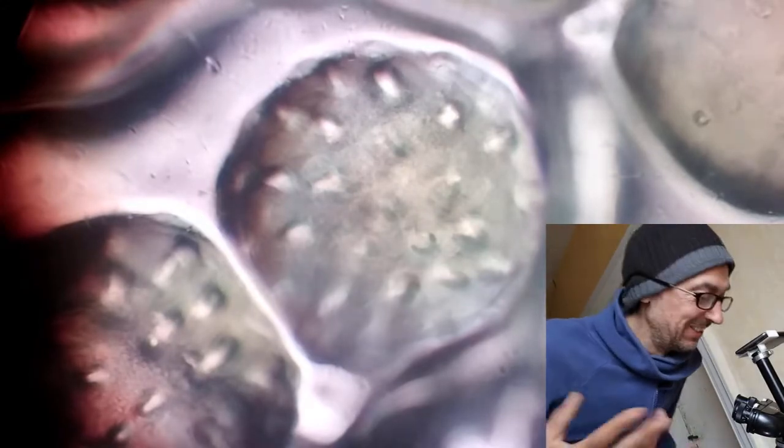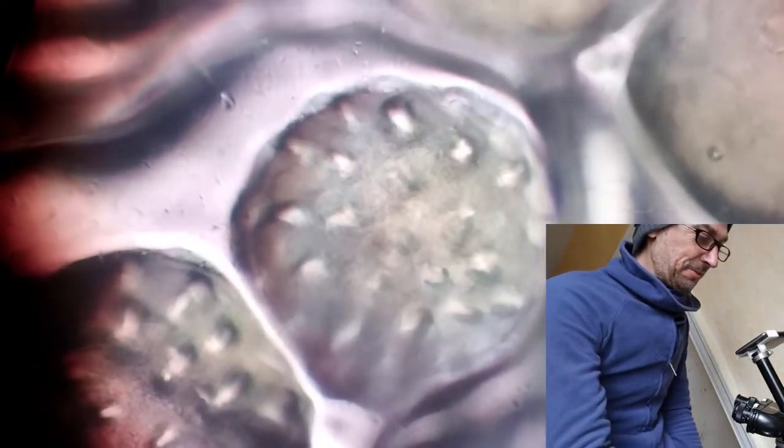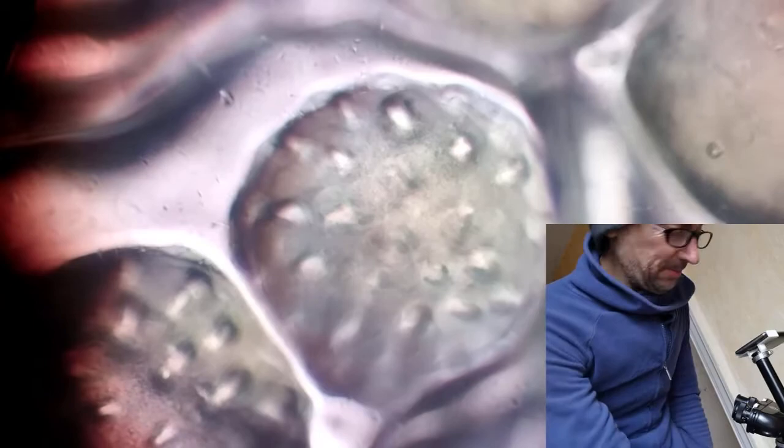I'm just plug and play - it has to work. With such scientific equipment, which I bought used for 200 euros, you have to really study and learn how to use the machine. But as you see, the tiny scope is quite impressive.